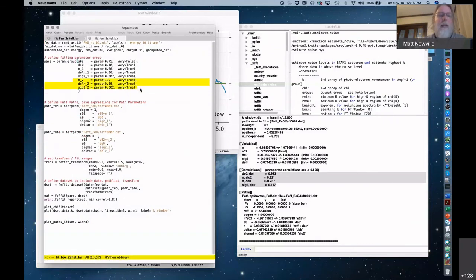Actually, I renamed n, del r, and sigma 2 to have an _1 to signify the first path. Then I added ones for the second path. So I added 3 more variables. So I changed these definitions a little bit. And here, E0 is still the same for the 2 different paths. It's the same parameter here and here. I have the path 002 for the path for iron. The Fourier transform data information is the same, and now the path list is just a list of paths.